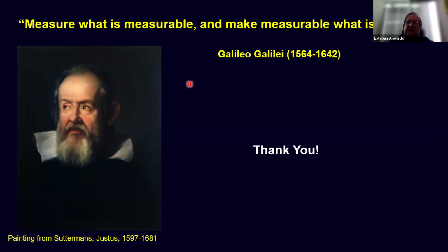So, Danuta, there is one point that is important here. Everything depends on what you are willing to do. In metrology, there is a very basic rule: if you do not have traceability, you cannot ensure that a parameter you measure has a given value. You should have traceability. If the only objective here is to publish a paper, then it's no problem. You measure, fit with any model, and then you publish. That clearly works.